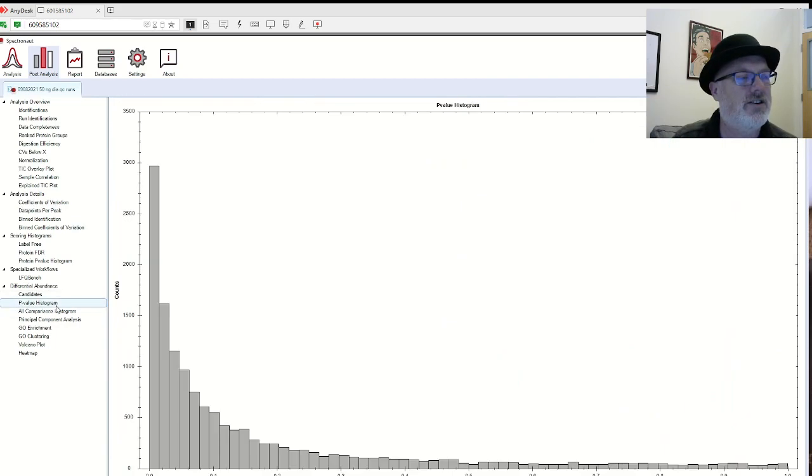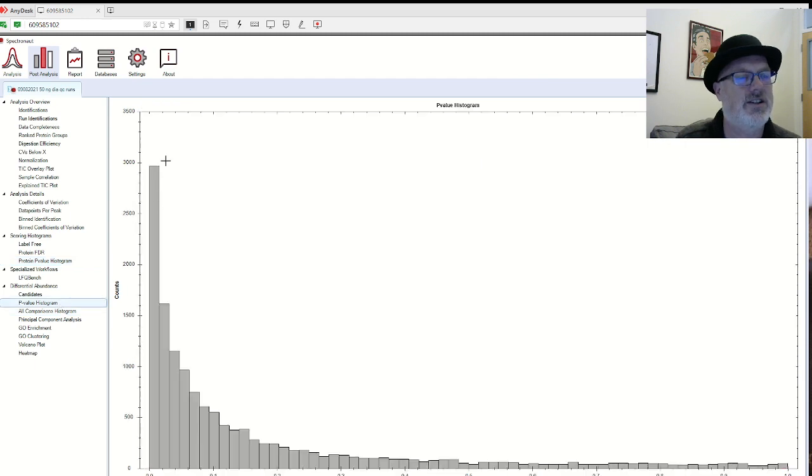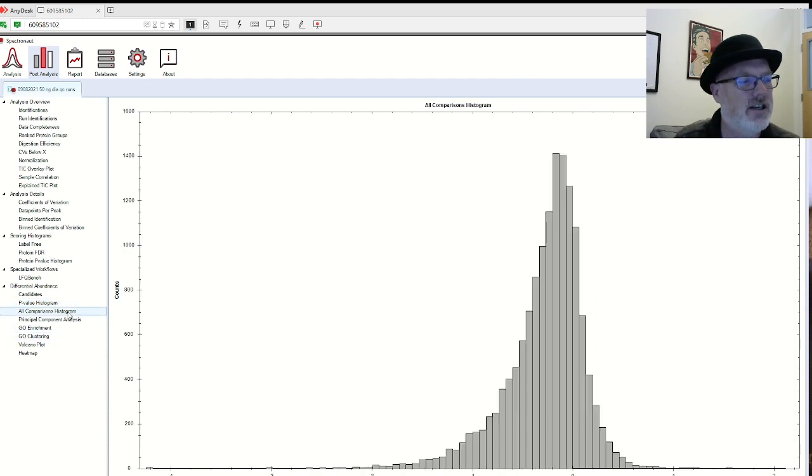You can look at the p-value histogram. Remember, this is a different p-value histogram than the one above, which is trying to figure out what signals are real peptides. This is actually a p-value histogram of the differential expression. You can see it's okay, right? Not as sharp as it used to be, but it'll work fine for a multiple testing correction, like a BH correction, right? So you want to watch out for your p-value shapes when you're doing multiple testing correction.